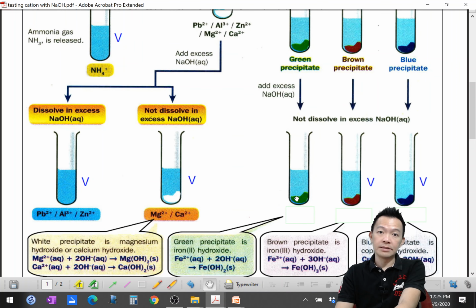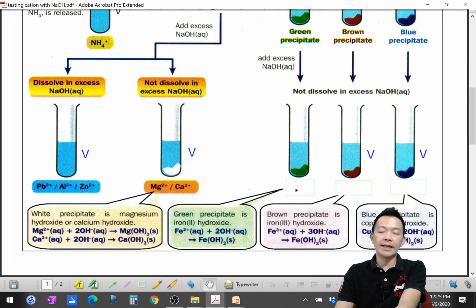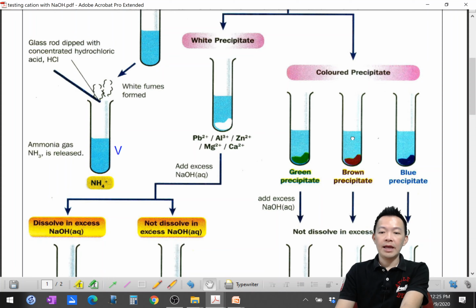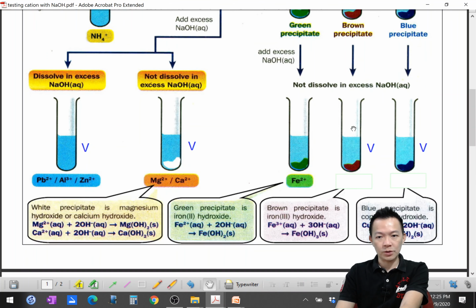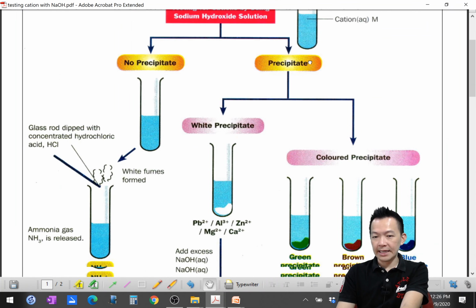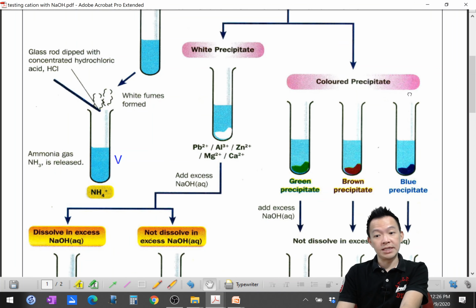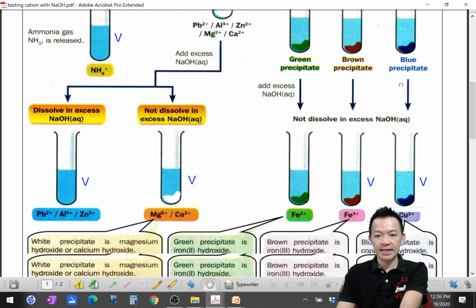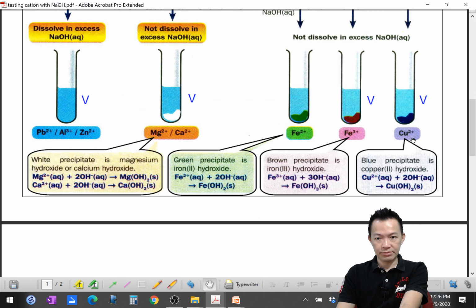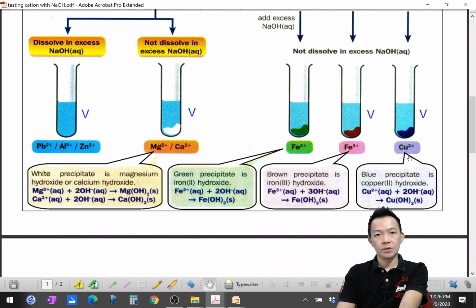Okay? So the green color actually is what? 如果它是青色代表它是什么盐水呢? Iron two, 这种盐就叫 iron two. Okay, so add sodium hydroxide, you get a color precipitate, 拿到有颜色的 precipitate, and the precipitate is brown color, 可可色的, 加多多不能溶解, and it must be iron three, 那种盐水就叫 iron three 的盐水, the cation inside is iron three, 就叫铁三. Okay, add the sodium hydroxide, you get a color precipitate, 你看到有颜色的 precipitate, and it's blue color, 它是蓝色, add excess, 加多多. The blue color precipitate insoluble, 不能溶解对不对. So it will be copper two, 就代表着它的 copper two.